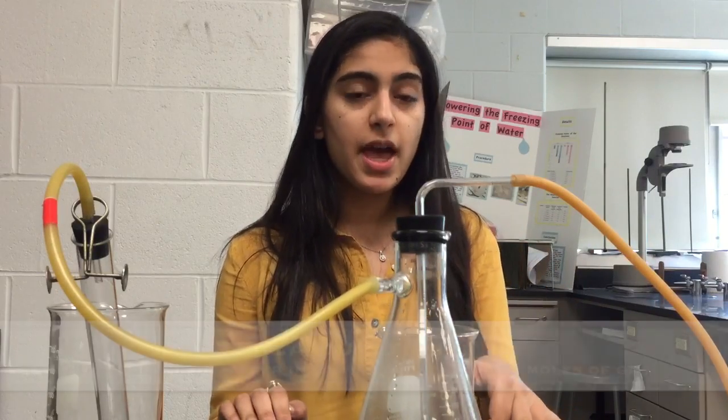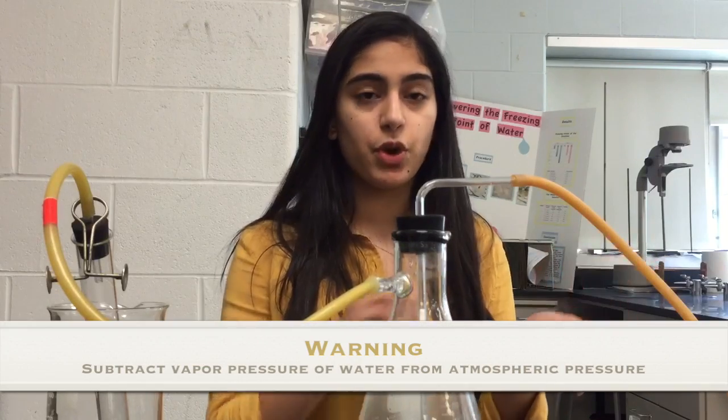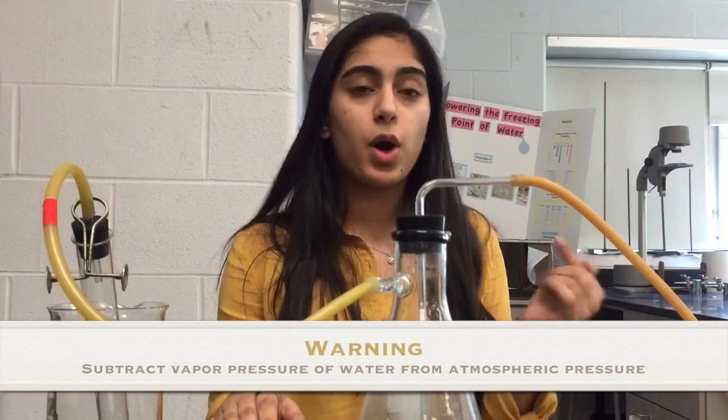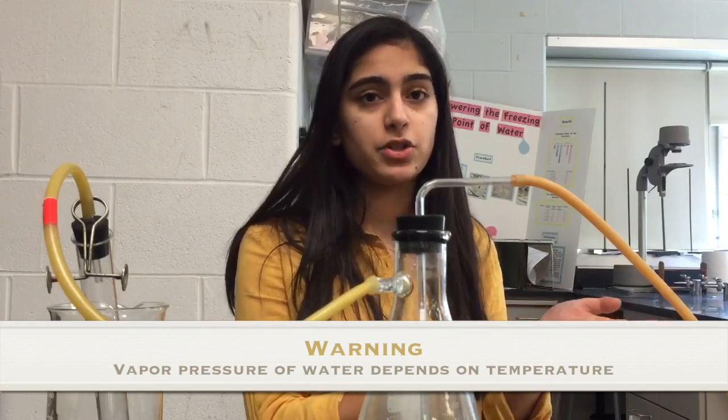Take the volume from your collection beaker and use it in the equation PV = nRT. For the pressure, make sure to record atmospheric pressure and also account for water vapor pressure — subtract the water vapor pressure from the atmospheric pressure to get the corrected pressure to use in PV = nRT. Once you have calculated the moles from PV = nRT for your alloy trials, set up a system of equations to figure out the ratio of aluminum to zinc in the alloy.